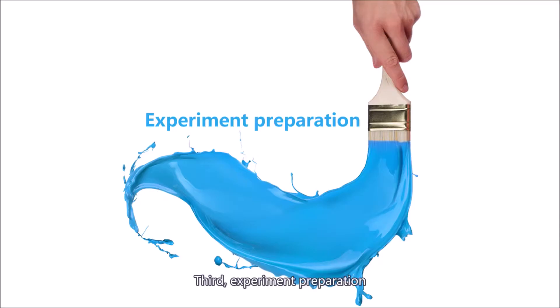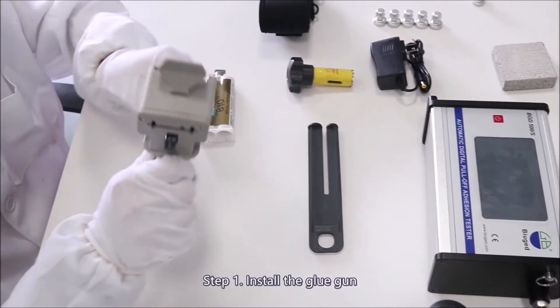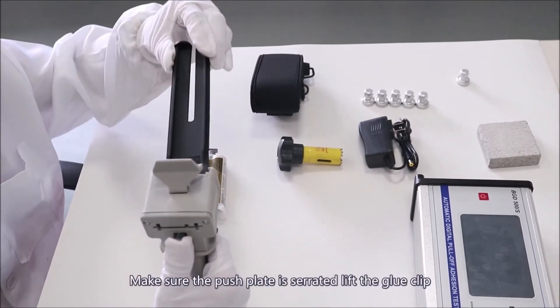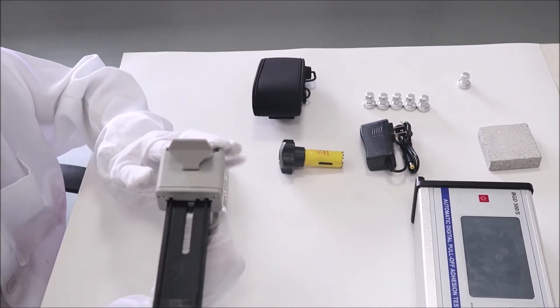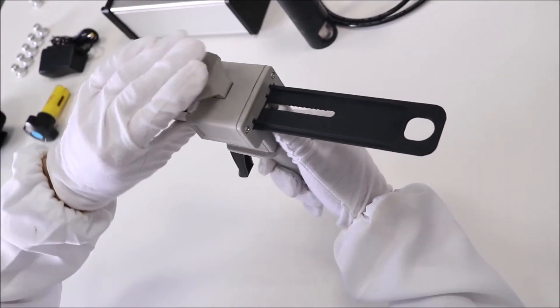Third, experiment preparation. Step 1: Install the glue gun. Put the metal piece upward and then insert the push plate. Make sure the push plate is serrated. Lift the glue clip. Put the two-component adhesive on the front of the glue gun and then fasten it.